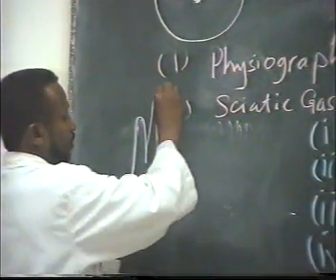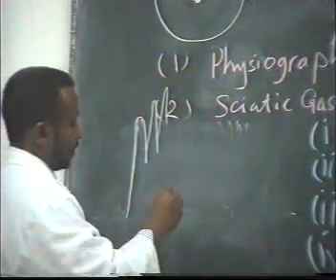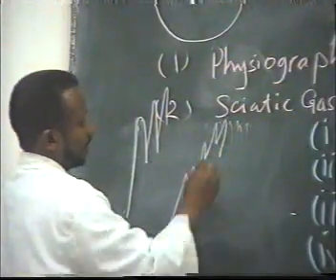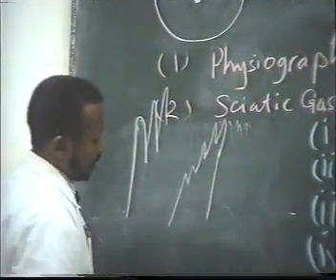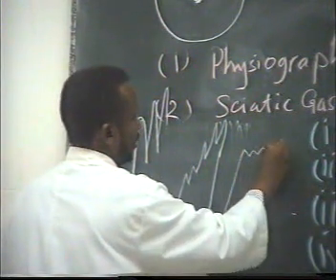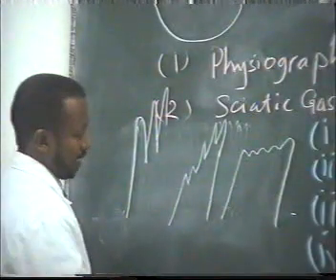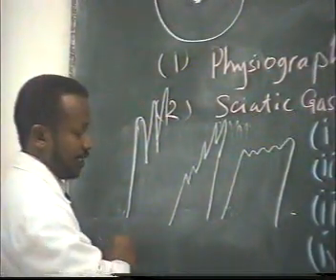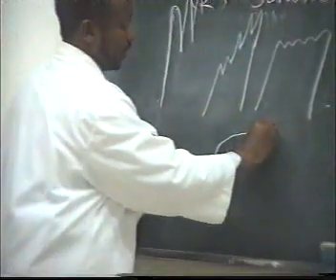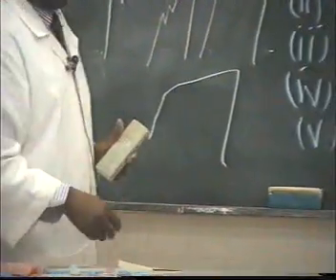So before relaxation, we go, and as we increase the frequency, it gives a staircase contraction, and as we increase further, the relaxation will be incomplete. This is known as incomplete tetanus. And if we further increase the frequency of the stimulation, the muscle will stay in contraction for a long time. This is known as complete tetanus.